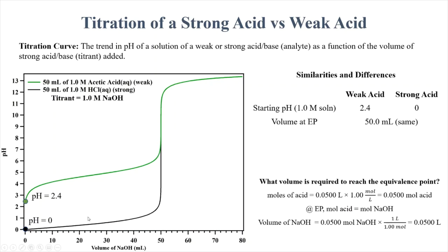Now, when we start to approach the equivalence point, the excess reagent, the HCl, is starting to get smaller and smaller. There's less and less HCl in that solution. So you can imagine that as you get very, very close, you're essentially going to have very little or almost no HCl, and now you're putting in a strong base. And when you're putting in that strong base and your HCl gets small enough, the pH is going to go from something acidic to something basic very, very quickly. And we remember from the strong acid case that when we reach the equivalence point, because the products of the reaction of HCl and NaOH are water and sodium chloride, we get a pH of 7 at the equivalence point.